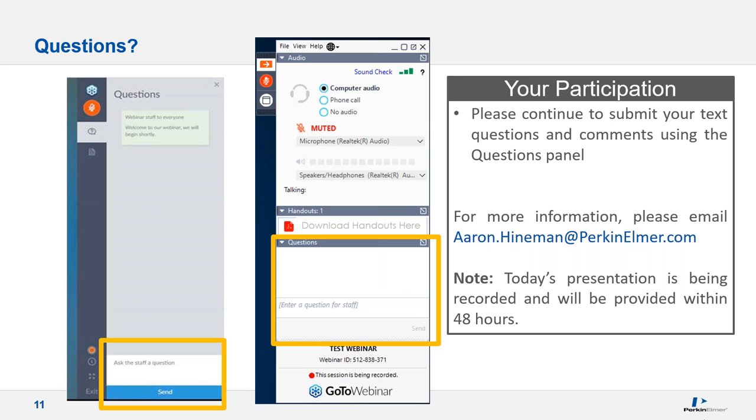This is an interesting one. How do you handle interferences related to uranium analysis? I mean, uranium probably has a lot of emission lines. I'm guessing they mean testing samples that are high in uranium or samples for low uranium. It doesn't really specify.